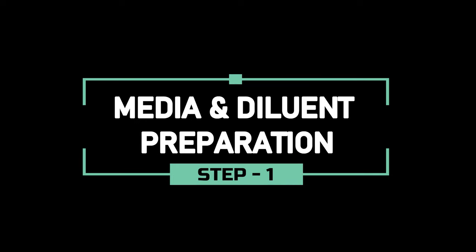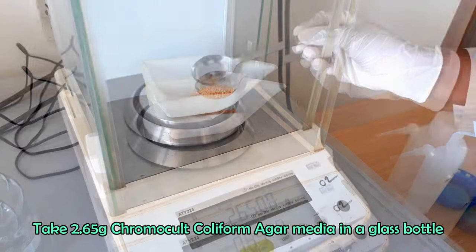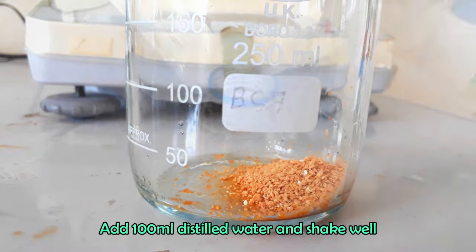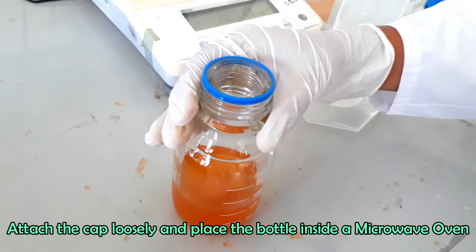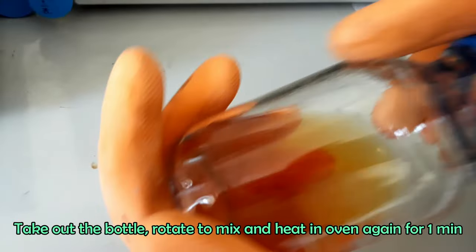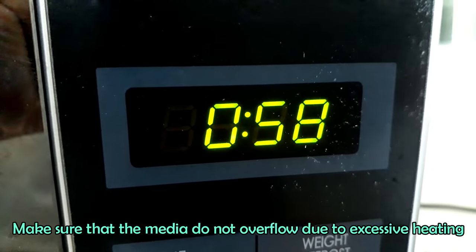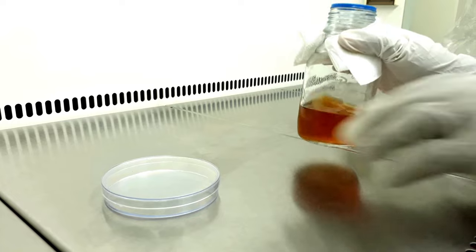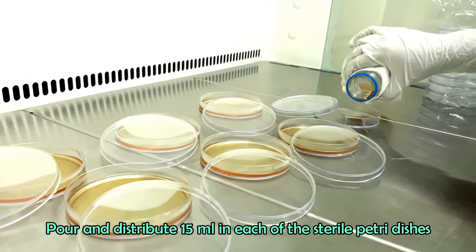Before going for the main test, just take a look at the media and diluent preparation. To prepare chromocult coliform agar, dissolve 2.65 grams of dehydrated agar media in 100 ml distilled water. Boil the media at 100 degrees Celsius in microwave oven or hot plate. Rotate the flask to mix the content. Apply heat if required, but do not overheat. Pour 15 ml into sterile petri dishes and allow the plates to cool and become solidify.